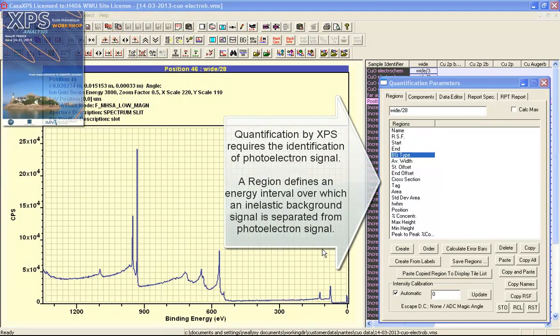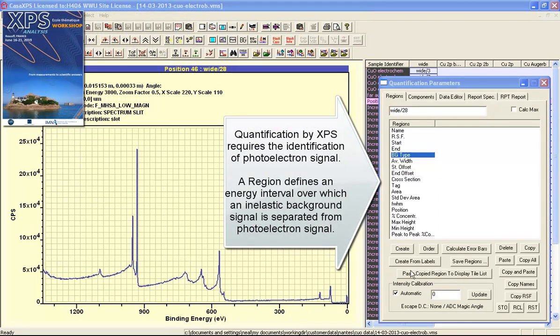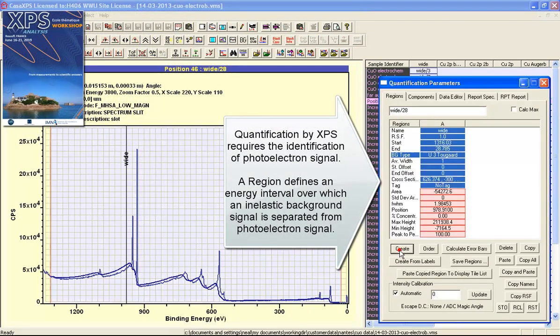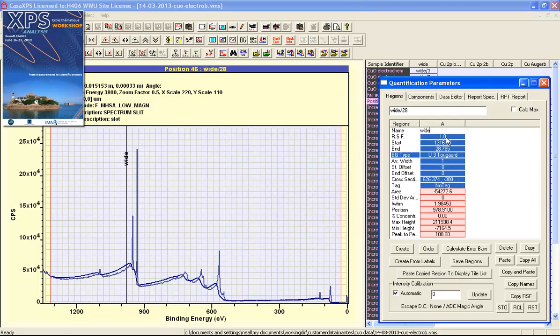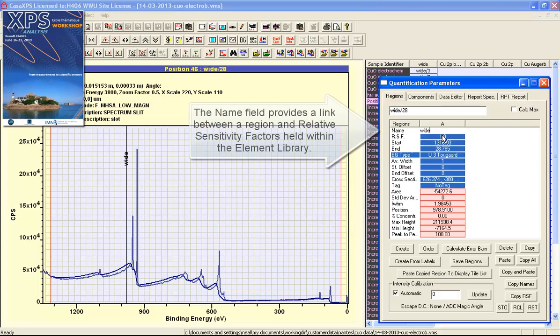A region is defined when we press the create button. The result of creating a region is that a set of parameters are established. These are all just default values that need to be updated with values appropriate for these data.